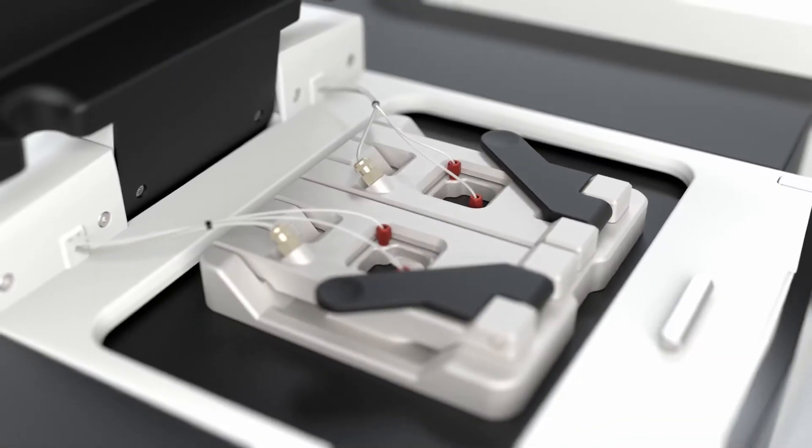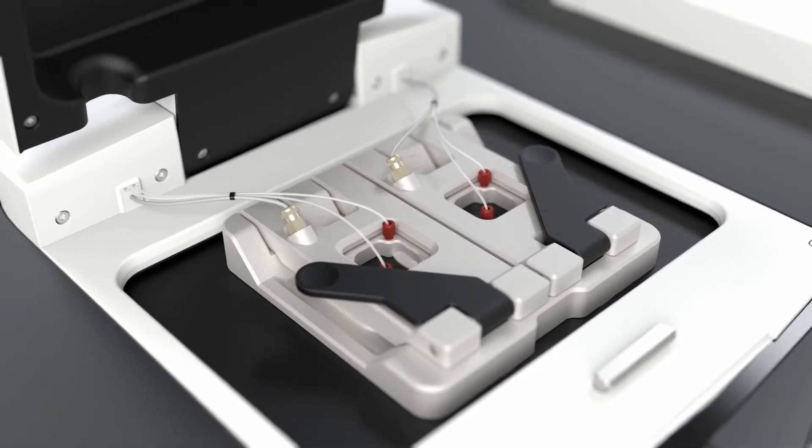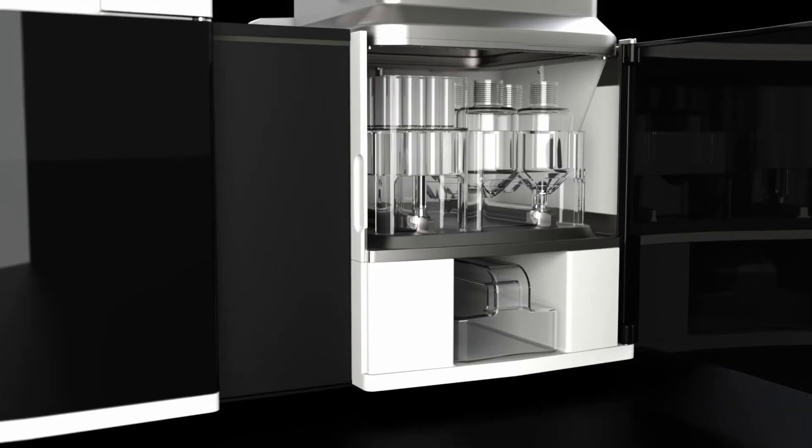At the heart of this solution, Veranome has designed an easy-to-use, reliable and automated imaging system with integrated fluidic control.